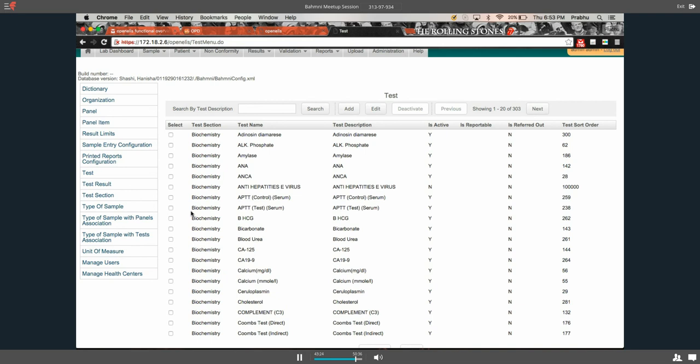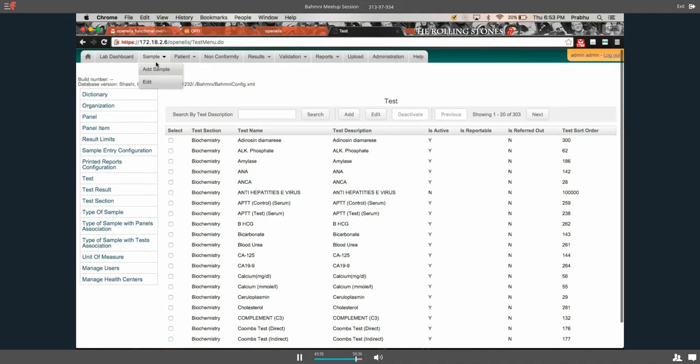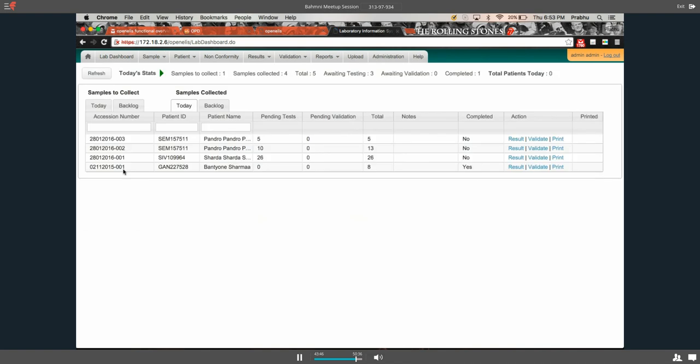So we have the facility to mark it as abnormal, right? Whenever a test result is entered and it is out of range, and you want to call it out of range, you have the ability. Let me just go back and show you. Say I want to enter the result for the same patient.